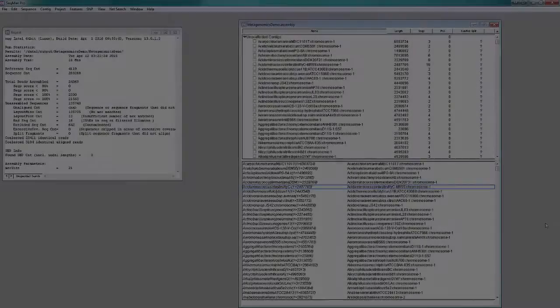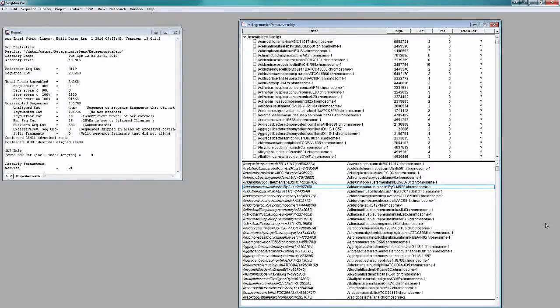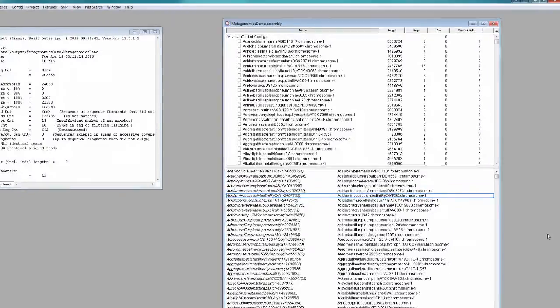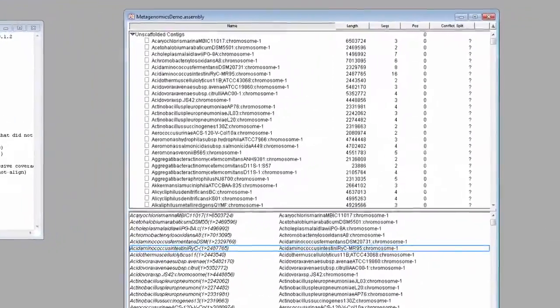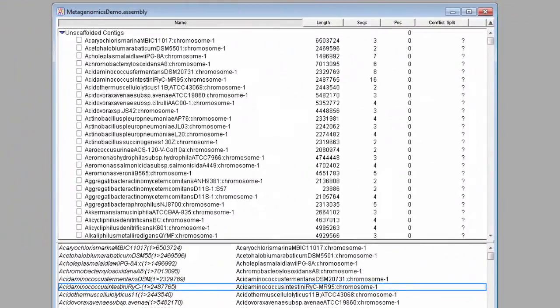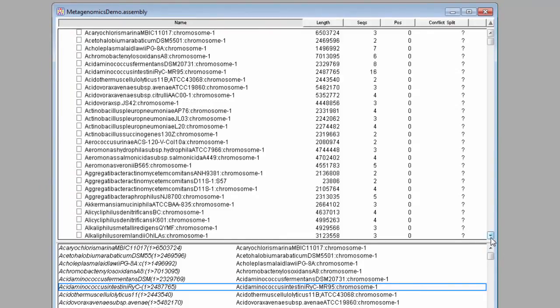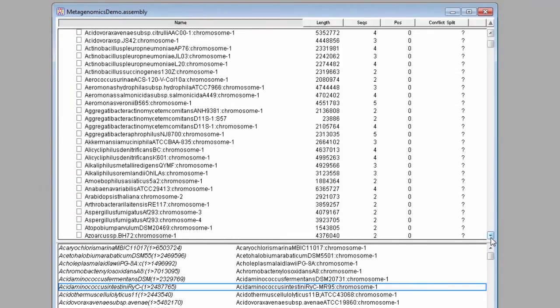After the assembly completes, the results can be analyzed in SeqMan Pro. In the project summary view, each bacterial template is shown as a unique contig.